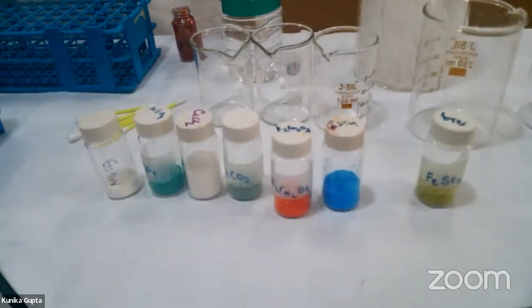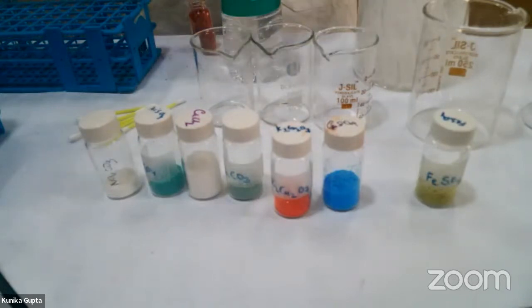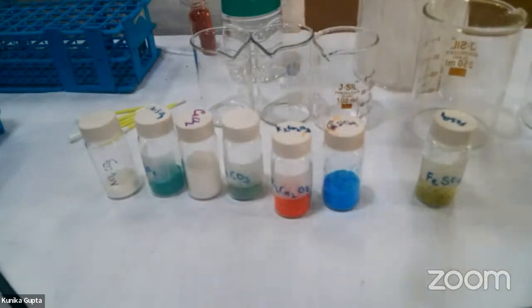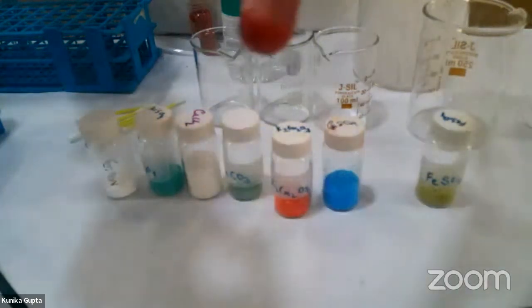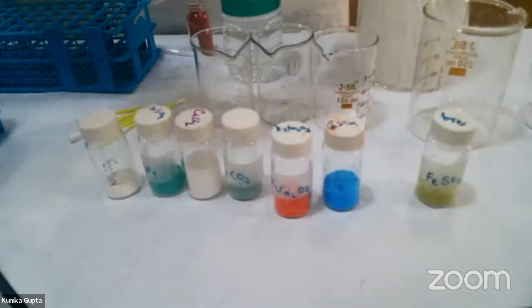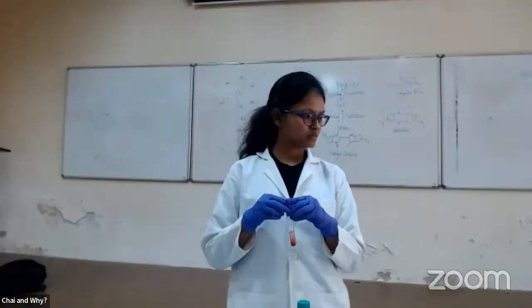So I have a few spatulas. These are not the ones which we use in lab, I just got this for the event. So I take a little amount of this compound, then I'll dissolve it in water.